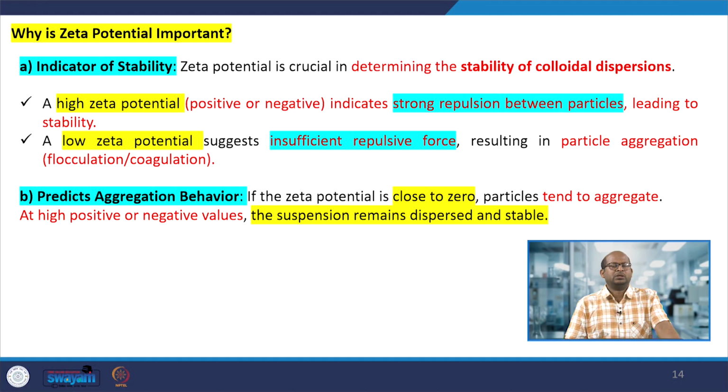I said that sometimes we use different types of thermal fluids for specific heat transfer and mass transfer applications. There, to improve the thermal conductivity and increase the heat transfer rate, sometimes with a particular solvent we also use some nanomaterials to increase the thermal conductivity of the solvent. If the nanomaterials are properly dispersed in the solvent, then the property of the solvent remains unaffected.